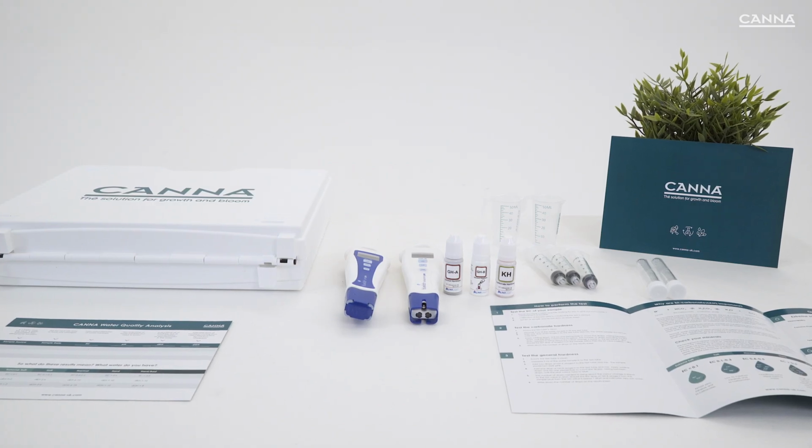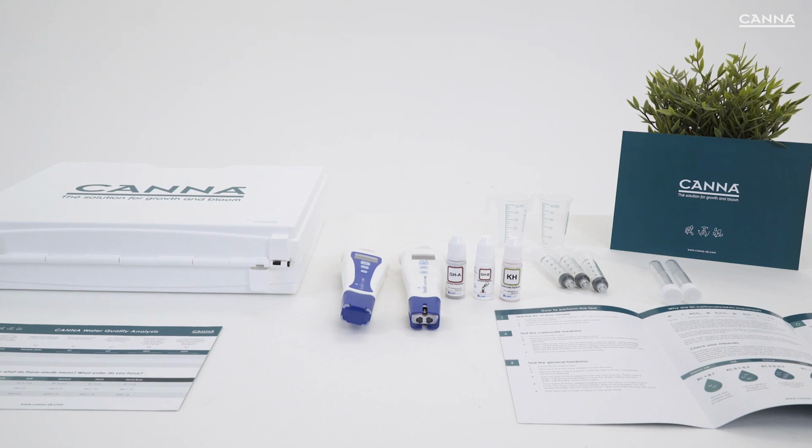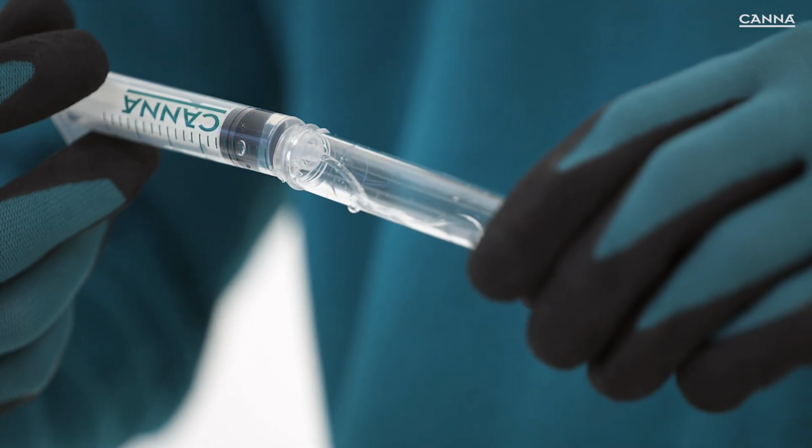The third measurement is the general hardness of your water. This shows the presence of useful elements like calcium and magnesium, or with bad water indicates the presence of sodium and chloride in the absence of a reading.